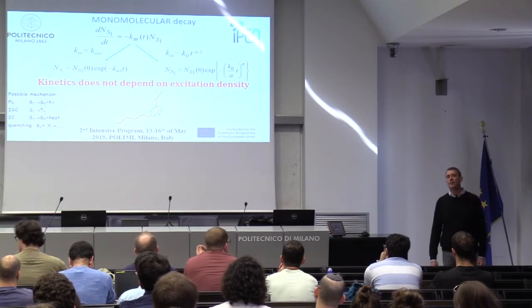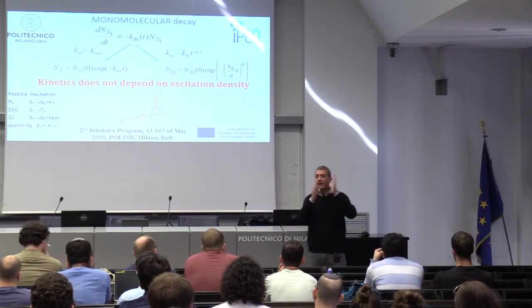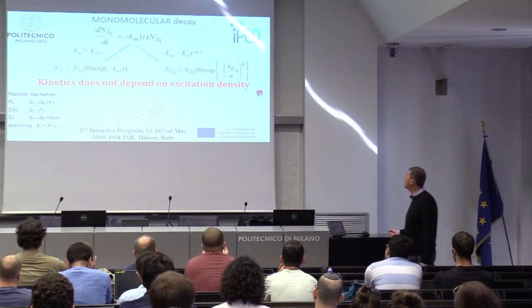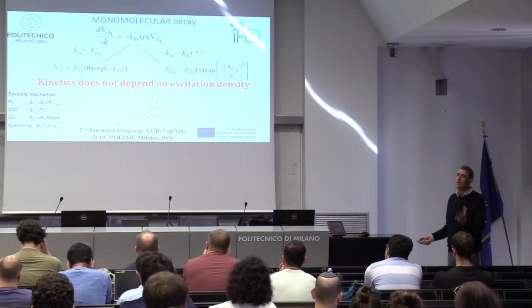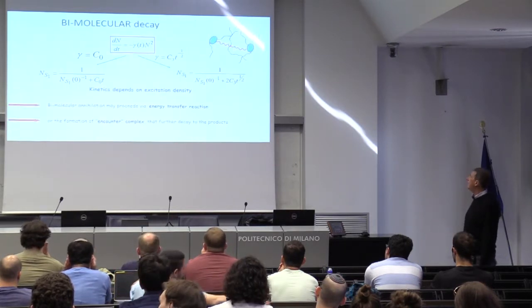The stretched exponential is a nonlinear decay, like the crack in the wall or this kind of phenomena that start fast and then slow down in time. So this describes most of the time a real story. The single-exponential decay is relatively rare to be found, because it means you have one single lifetime, constant, fixed for all the time. It's unusual. That's the monomolecular decay.